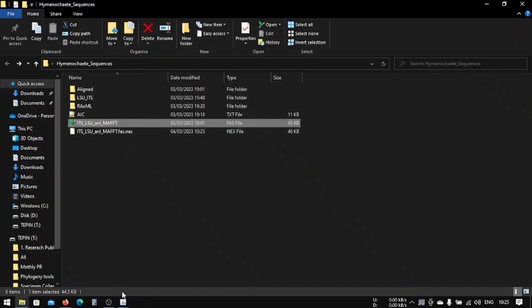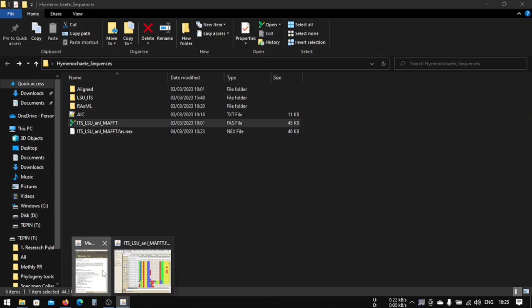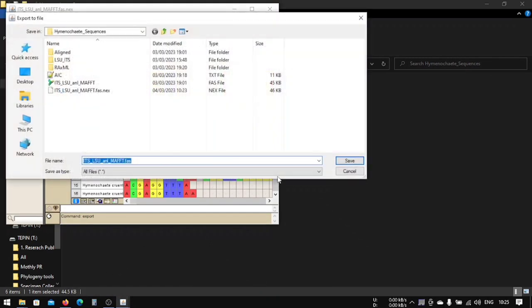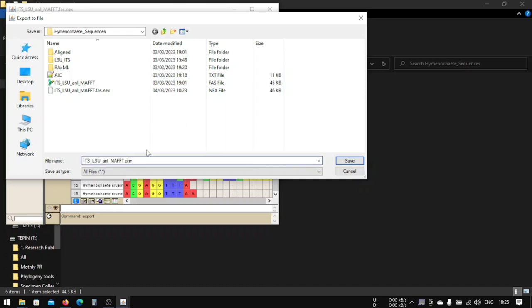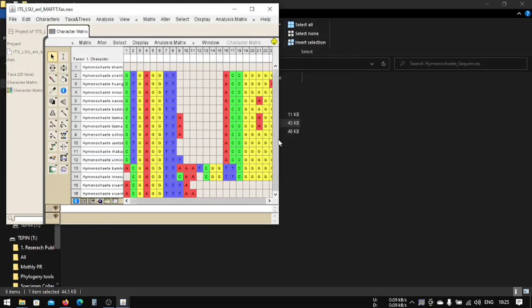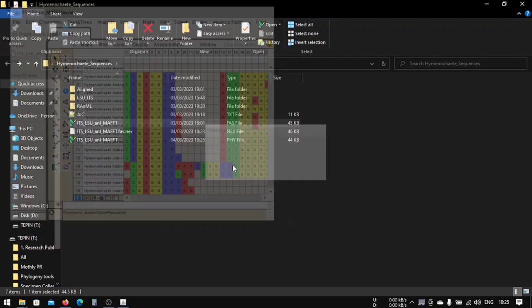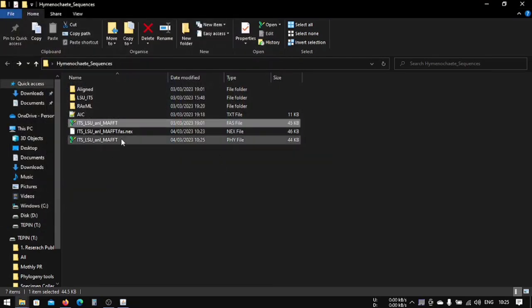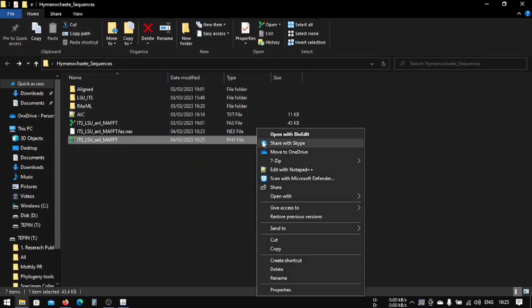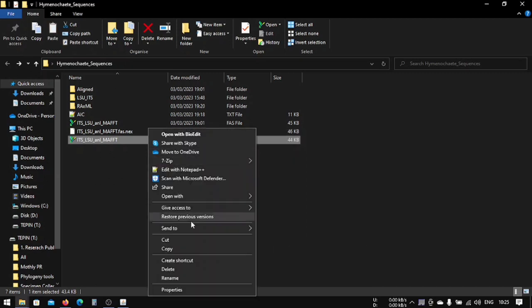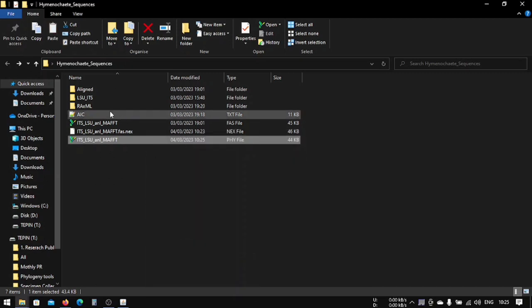Our taxon name length will be fifty, so we will choose this and export. Now we have to change this from FS to PHY because we are saving it as phylip file, and this PHY is the file extension. Let's save it. Now we can close this one. Don't save. Now we have here phylip file.